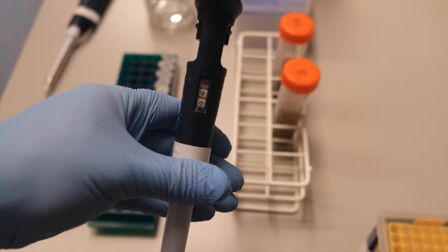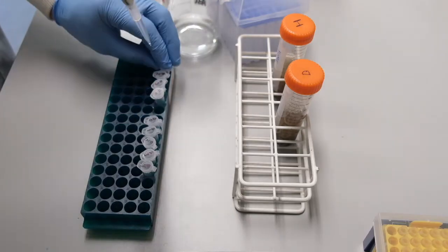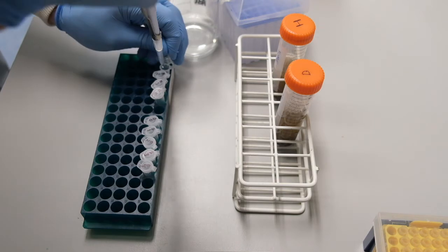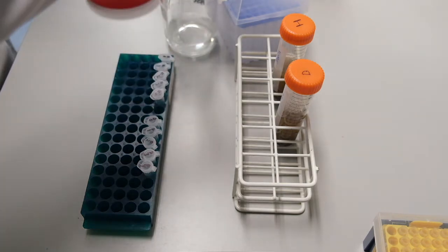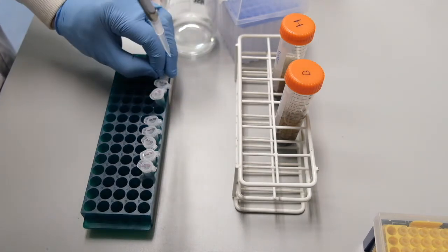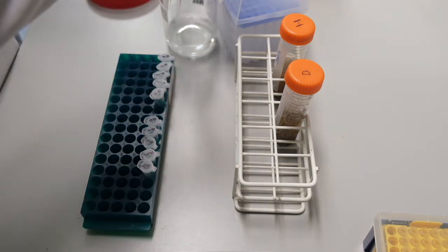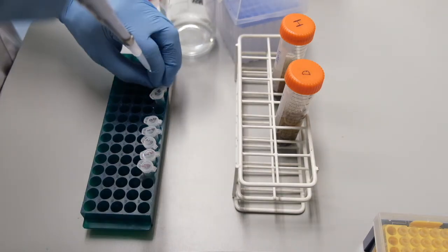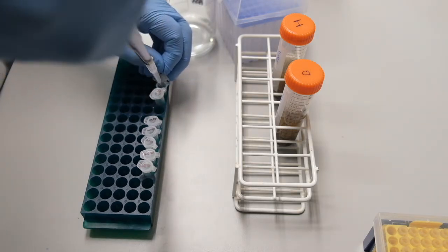We start by labeling all our tubes and putting 900 microliters of ringer solution into each of our dilution tubes. For each soil sample I have labeled five tubes. Four tubes for the dilutions get 900 microliters each of ringer solution. The extra tube is going to have the undiluted soil sample.